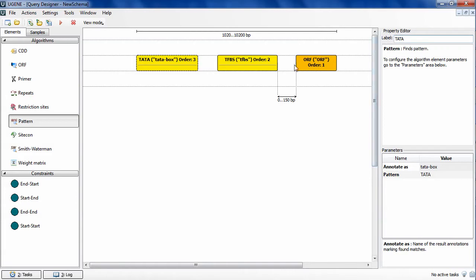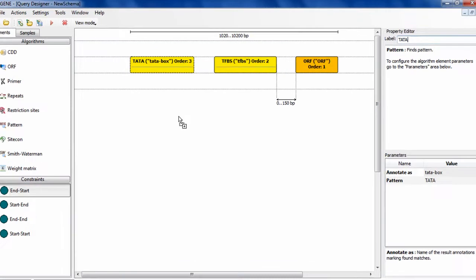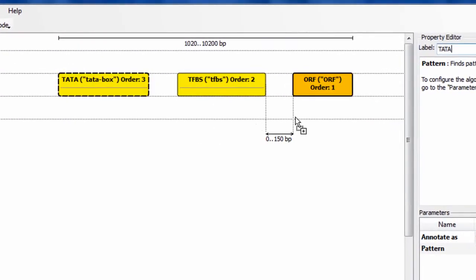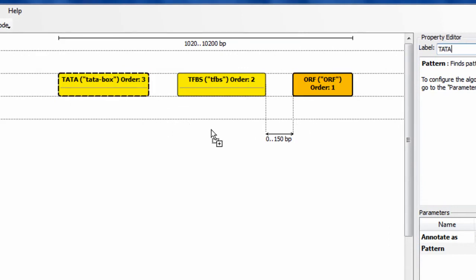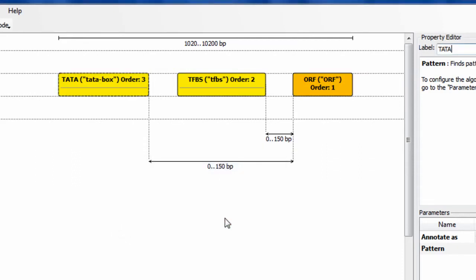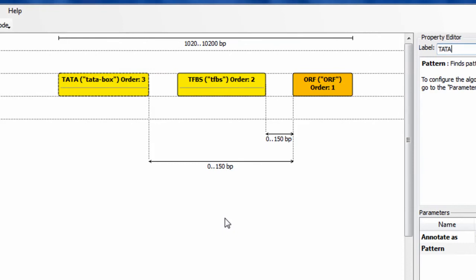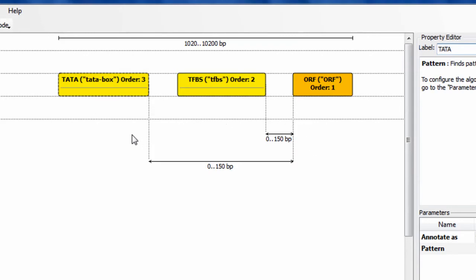Then I add an analogous constraint for the ORF and TATA box elements. The schema is ready. Its run will lead to finding every set of ORF, TFBS and TATA box regions that match the specified parameters and the constraints.